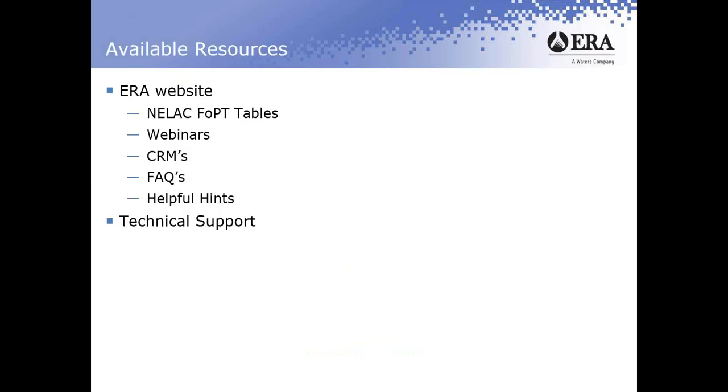There are other FAQs, frequently asked questions, out on the website that you could take a look at. If there were issues that I didn't cover related to reporting or use of product, you can find answers out there on ERA's website as well. We also have copies of the instructions that are located out on the website that will have helpful hints for the known samples. So you might find that a useful resource.